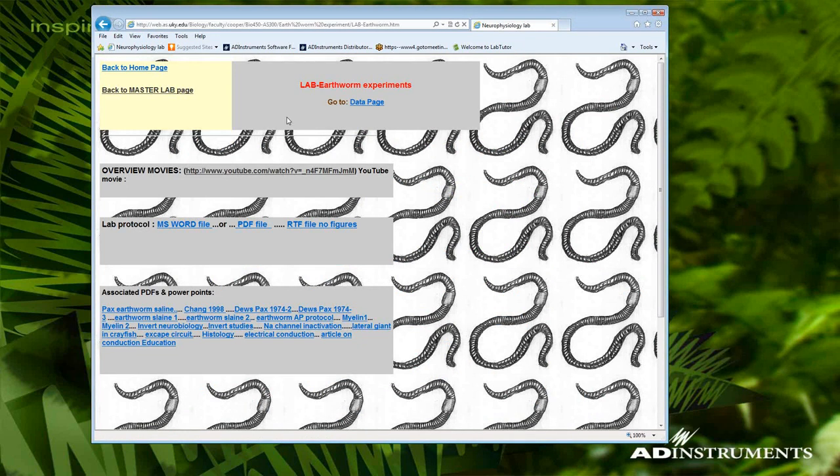This link is a link to a customer of ours, Robin Cooper, at the University of Kentucky, and he has done quite a bit of work with invertebrates, and he's been nice enough to post all of his protocols on his laboratory website, as well as YouTube videos of students actually performing these exercises.